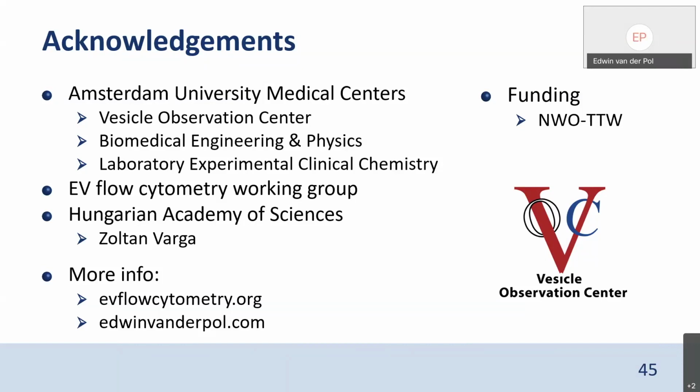Okay, we have another question here. Does antibody labeling of EVs impact particle refractive index? Can antibody labeling improve the detection of small particles undetectable with no labeling? So do the antibody labels affect the particle refractive index? That's a very, very tricky question. I think the best would be to measure it.